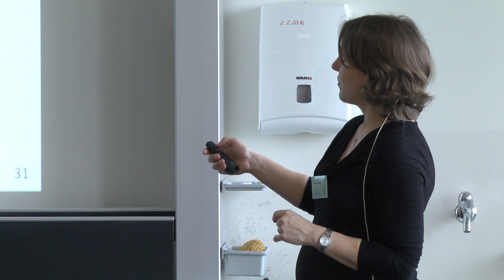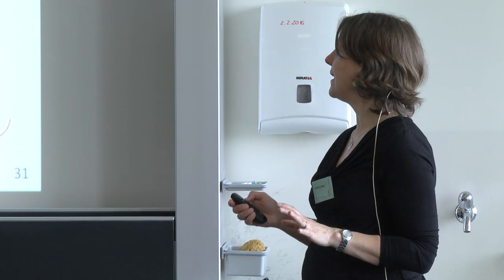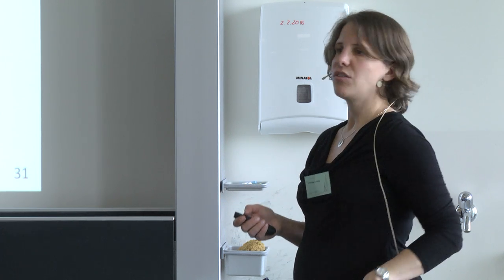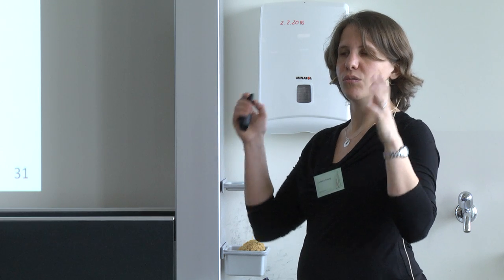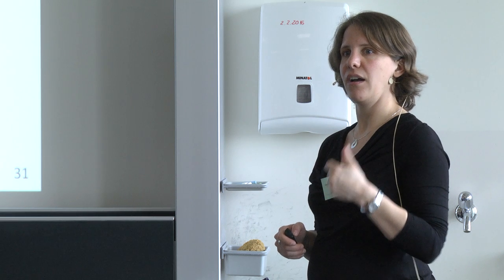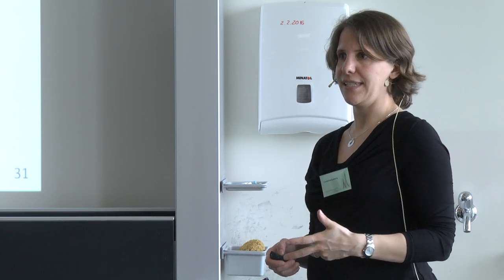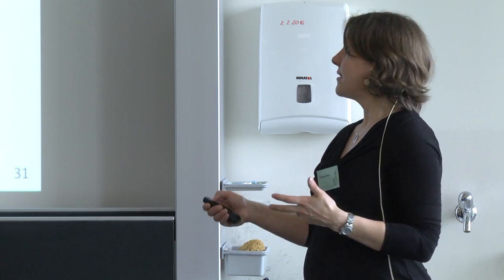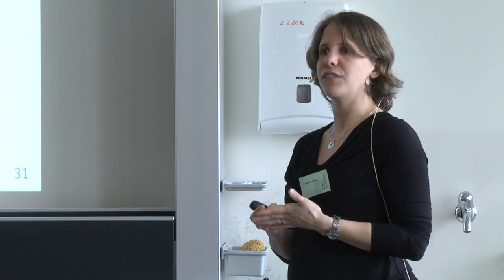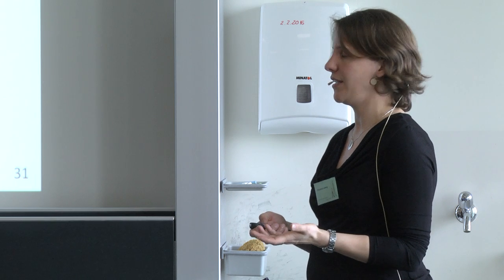So these first 3 criteria you can always apply. For this, you do not need to have any prior knowledge about your peptides. You can just take a transition list that you made up out of your mind, you measure it, and you can look at these 3 criteria. Where do I find chromatograms that coelute, have the same peak shape, and are very intense? Unfortunately, these 3 criteria are very often not sufficient to still really confidently identify a peptide in the sample. And this is why it's important to have additional criteria.